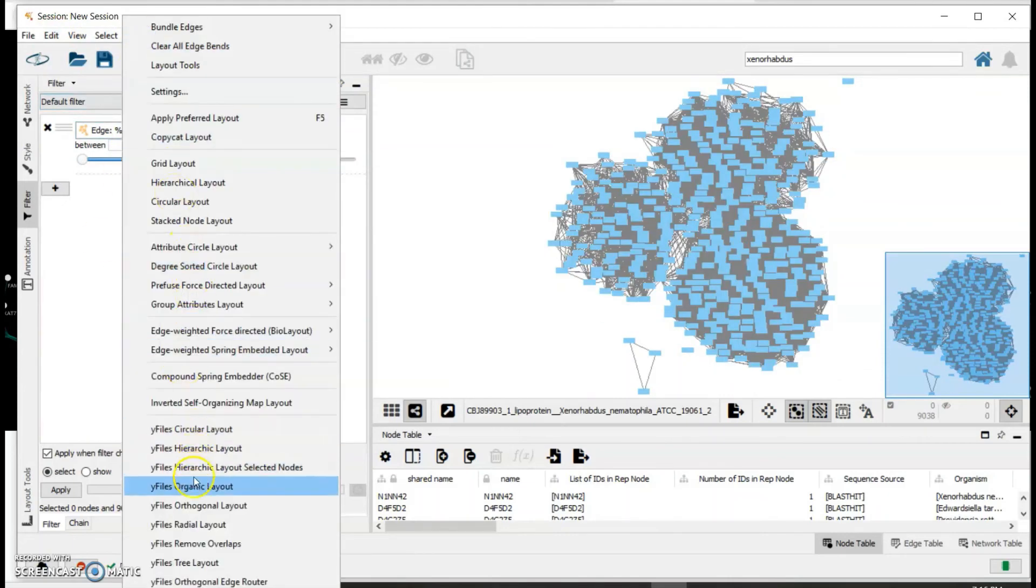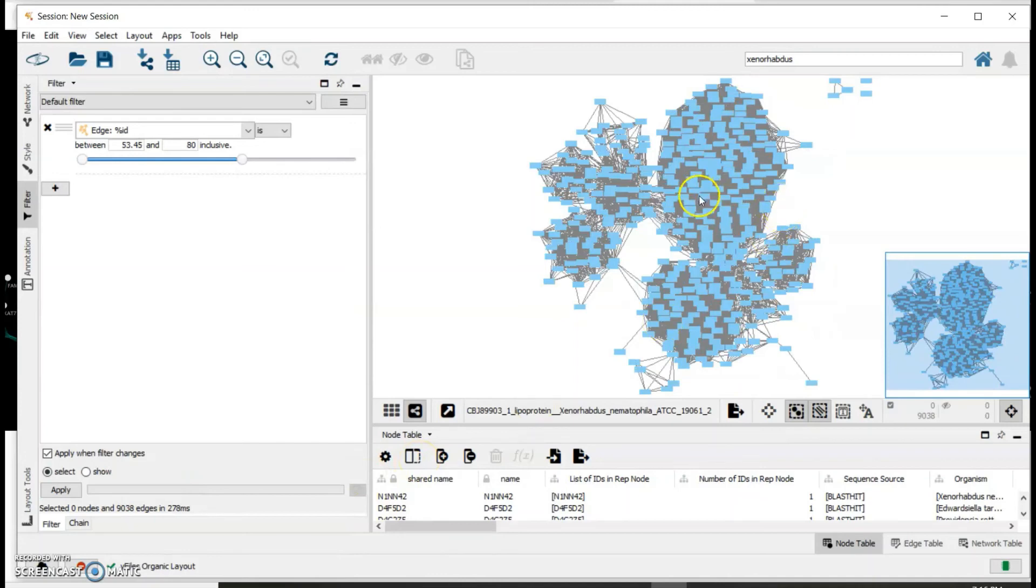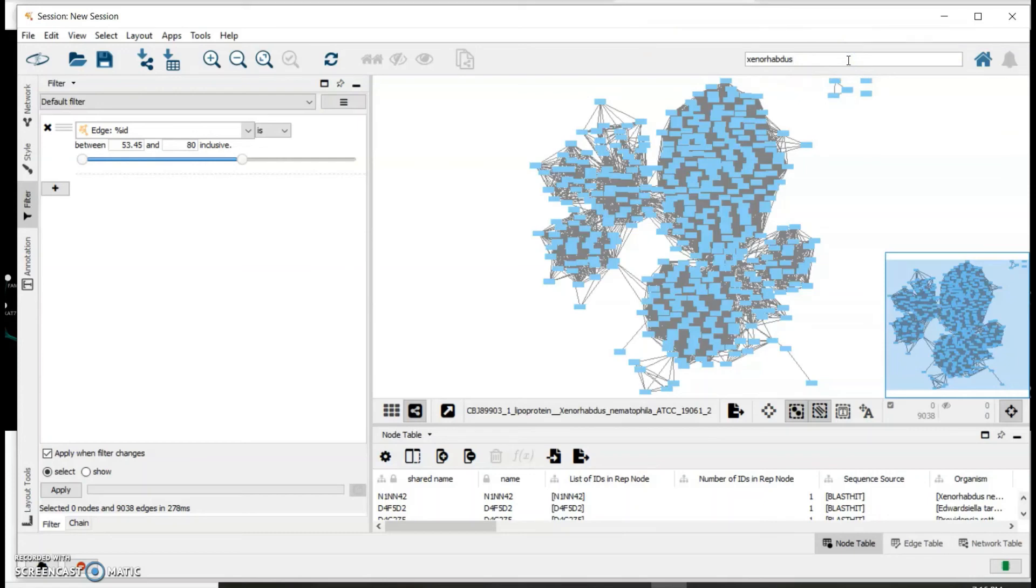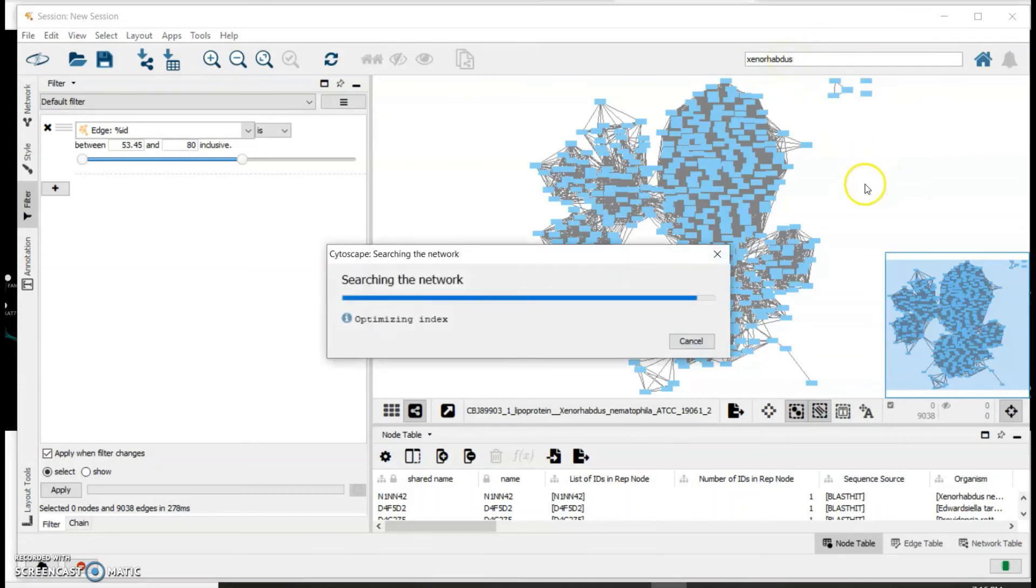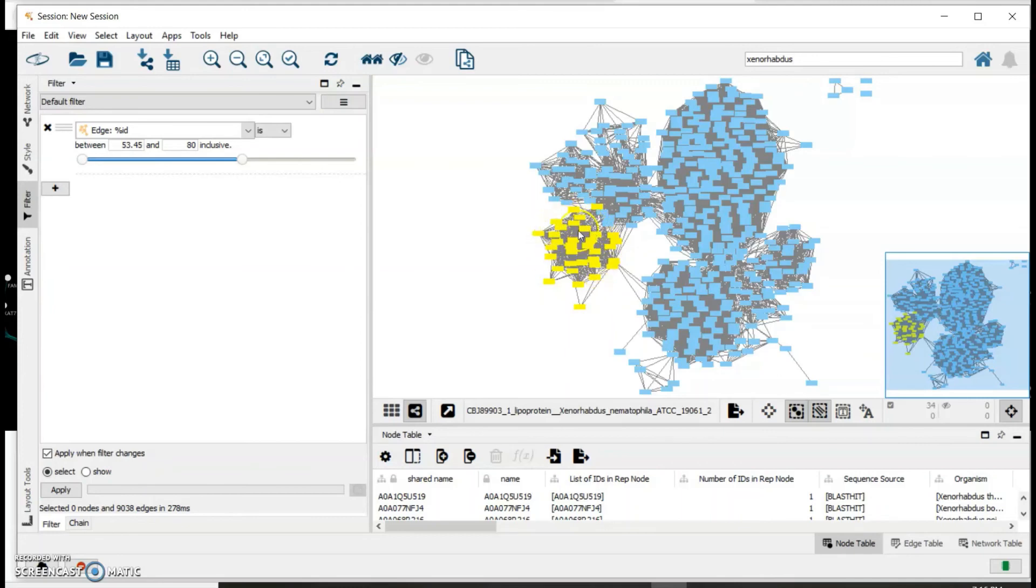And then do yFiles organic layout again. In this sequence similarity network you can see that the nodes are separating more. However, we can try to see if Xenorhabdus nlpc homologs are separating from nlpc homologs from other bacterial species. You can type in Xenorhabdus and press enter. All nodes that represent Xenorhabdus nlpc homologs are highlighted in yellow. As you can see, although they're starting to separate from the other nlpc homologs, they're still connecting.